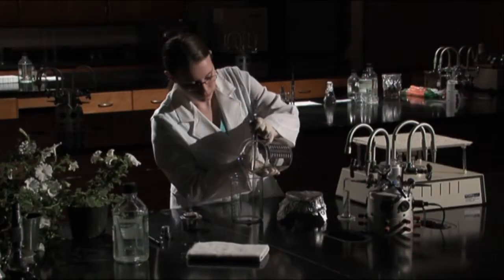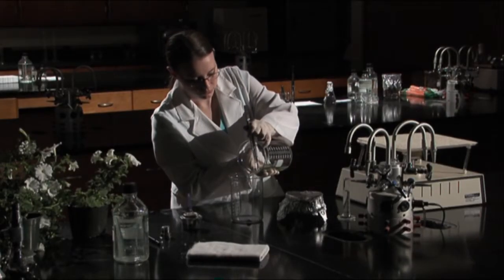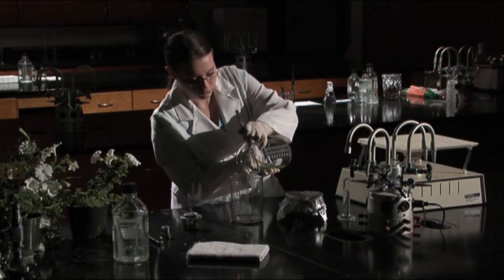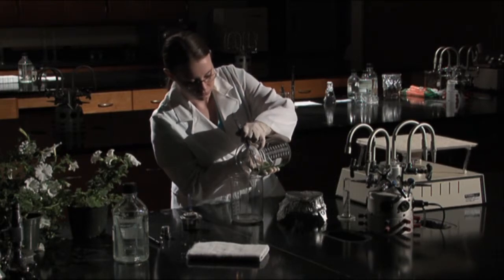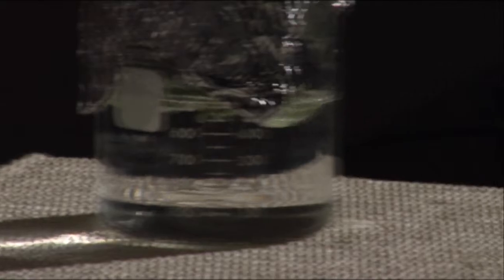Decant the bleach solution and replace it with sterile water. Replace the foil and return it to the shaker for 5 minutes. Do this step twice more.